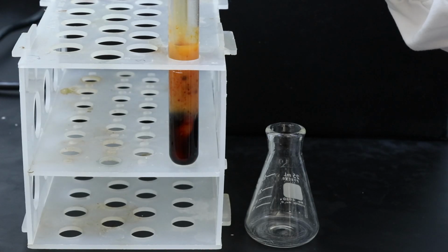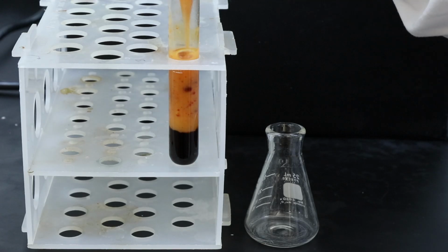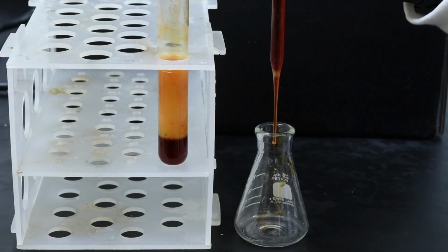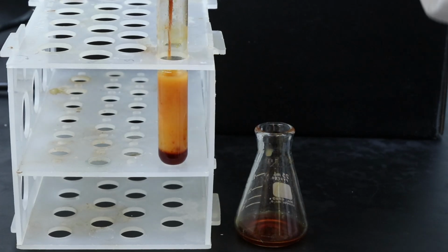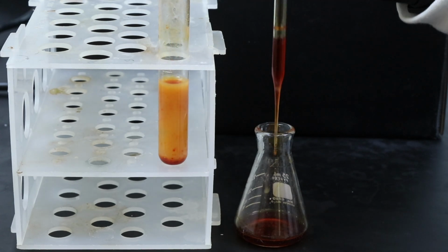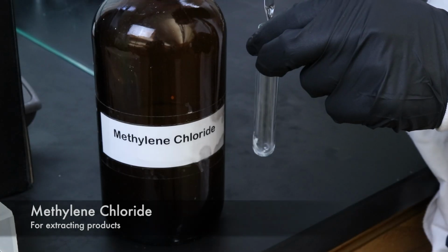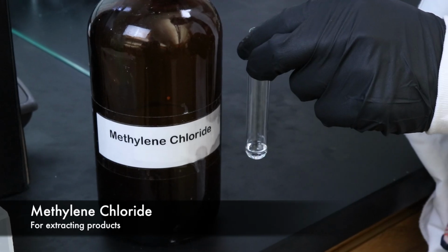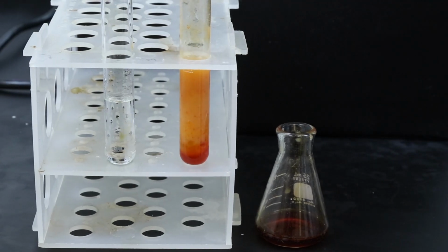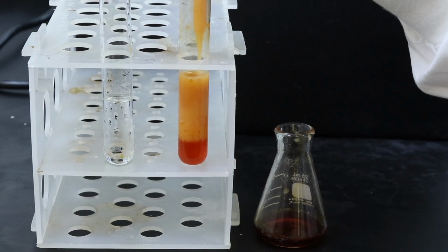I'll mix the phases together pretty well for a little bit, and then I'll start removing the methylene chloride layer and transferring it to a 25 milliliter Erlenmeyer flask. I'll get a separate test tube with some methylene chloride so I can begin the extractions, and I'll extract the solution 3 times just to make sure that I get as much product out of it as possible.